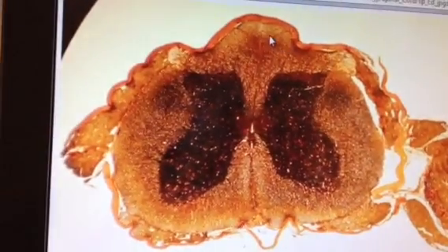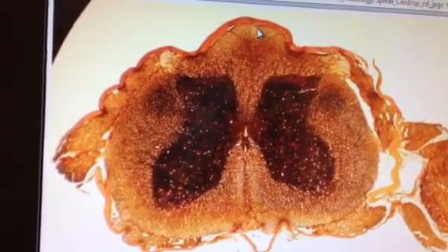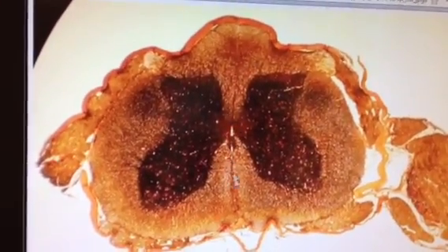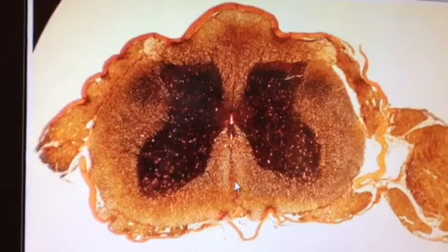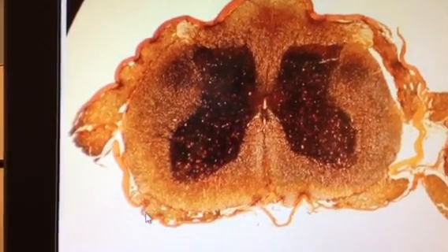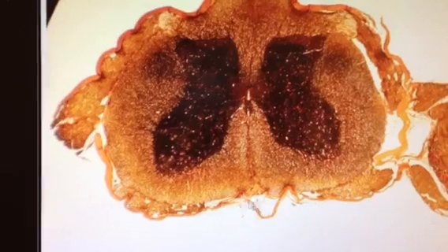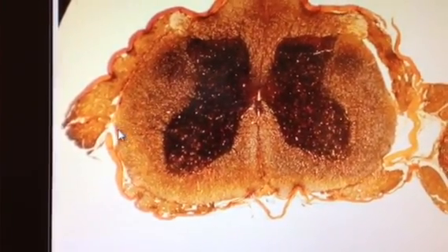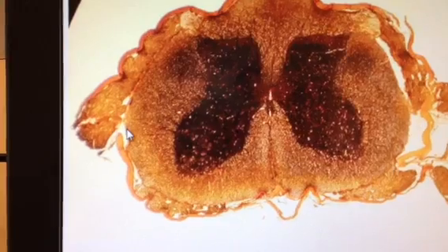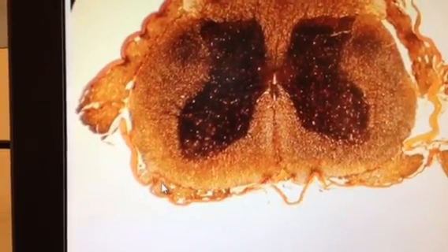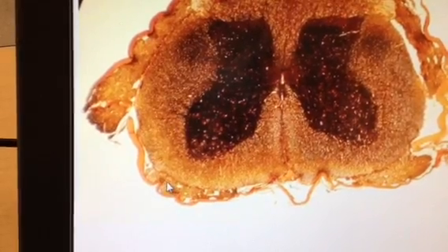Landmarks on the cross-section of the spinal cord include the dorsal sulcus, the central canal, and the ventral fissure. We have the dura mater extending around the entire structure, the pia mater on the surface of the spinal cord, and between them the arachnoid mater with the corresponding subdural and subarachnoid spaces.